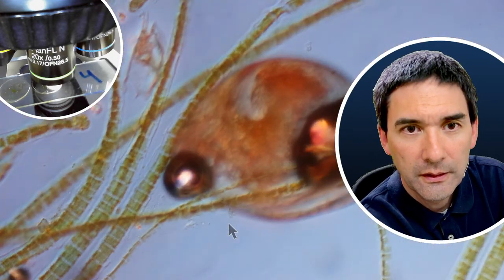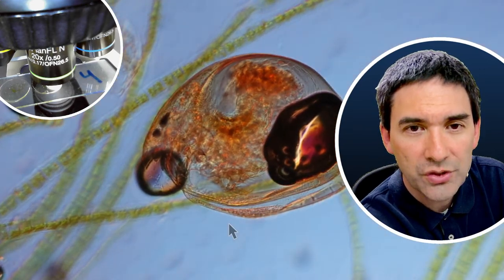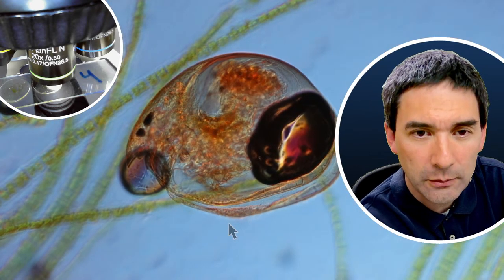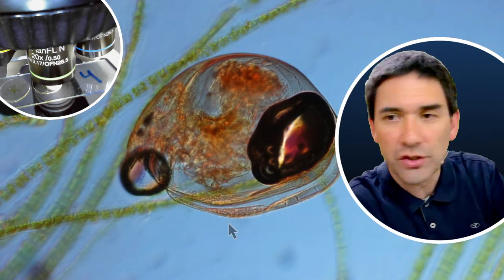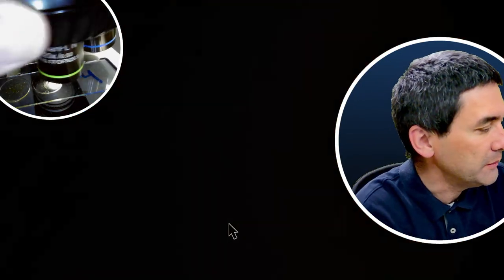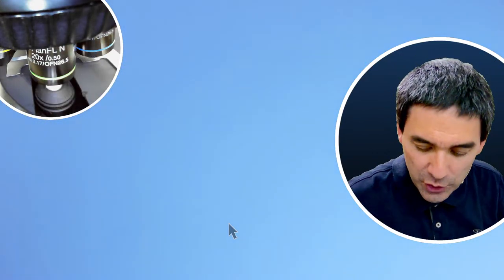Yeah. And what is this here? Do you see this? This is a water crustacean. Okay, also preserved in glue and two gigantic air bubbles. So this was just to demonstrate that this water-based PVA glue actually does work.